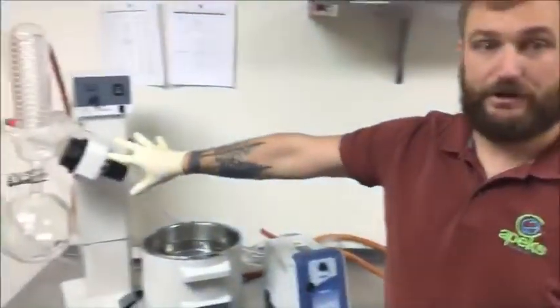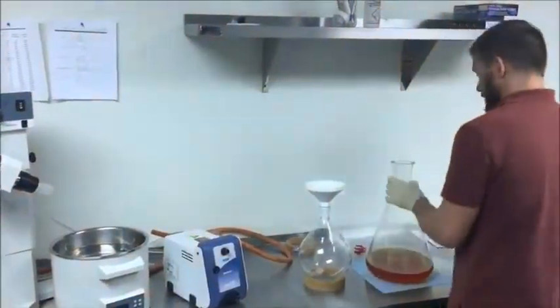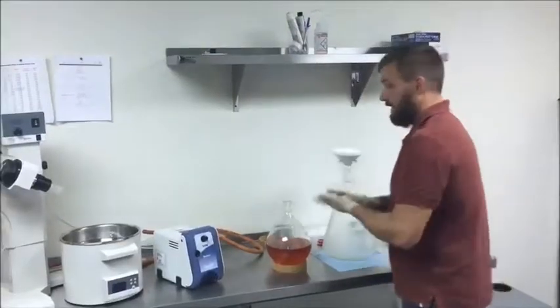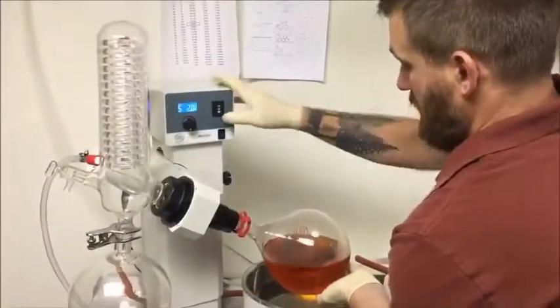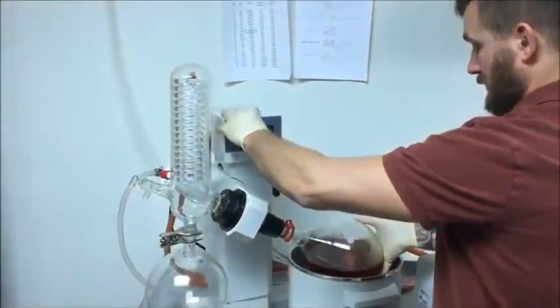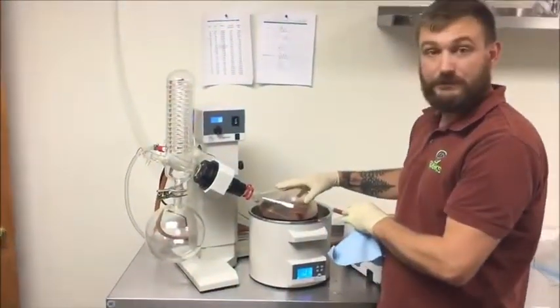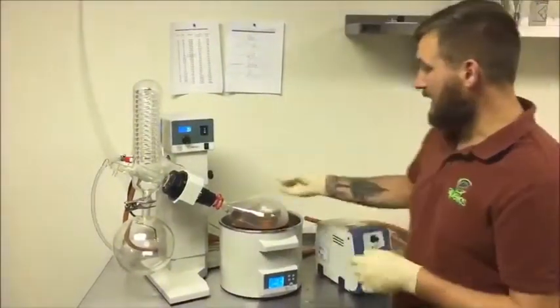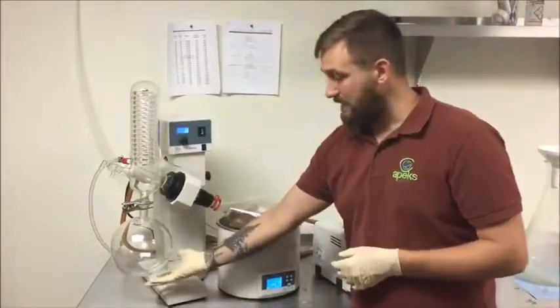This is a rotary evaporator, little mini distillation setup. I'll take this here, put it in this bulb. Now, we'll take this, we'll connect it. So I have hot water in here. It's going to heat up our solution. I have a vacuum so the ethanol boils off really easily. The ethanol boils up, comes over here, condenses on the cold coils, and falls down into here.